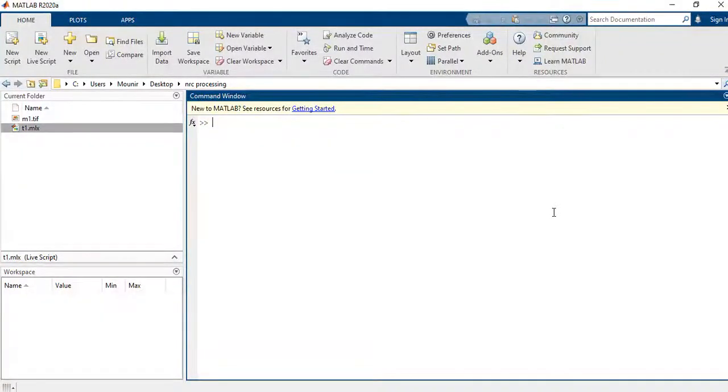Munir Shaib, and I'm going to present Matlab, and I'm showing through it some imaging techniques. First of all, Matlab is a platform that allows researchers to make a lot of processing techniques. It's composed of a command window where you can write your simple code, and a workspace where it shows you all your variables, and the folder where you are acting on.